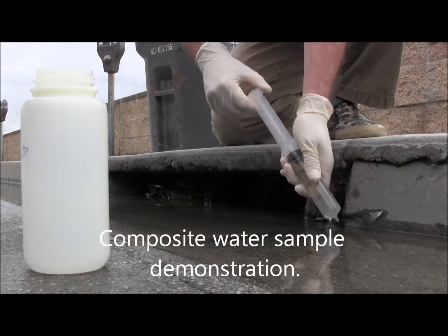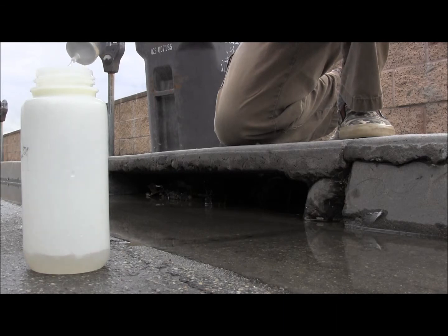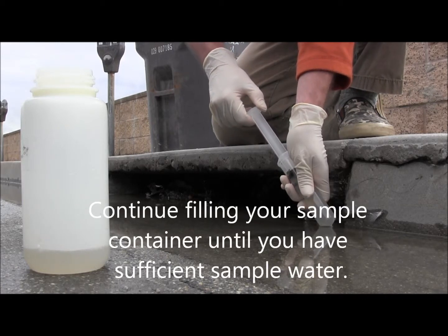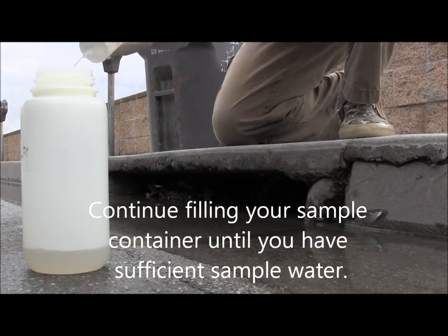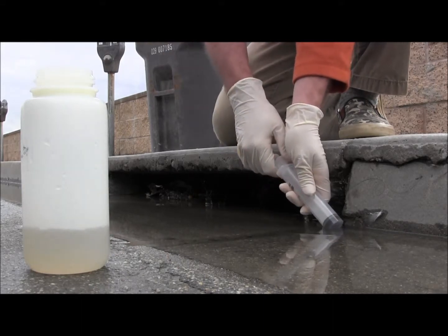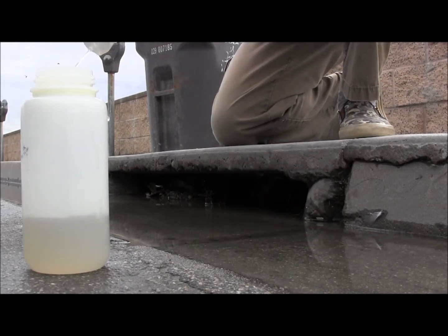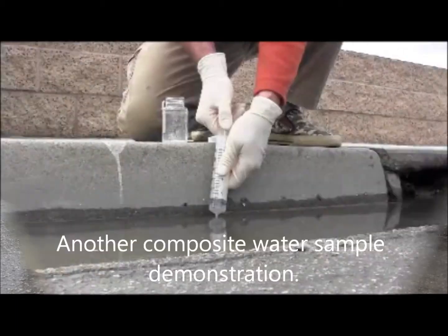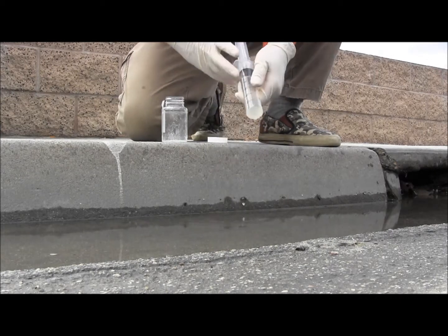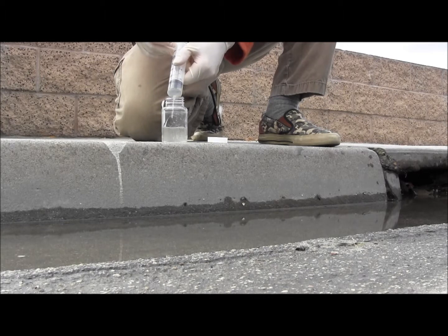Since the syringe cannot collect sufficient sample with one pump, it will be necessary to create a composite sample from many individually pumped samples. Let's take a look at this.